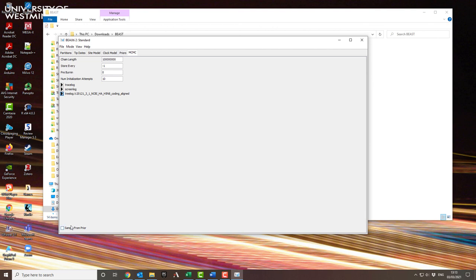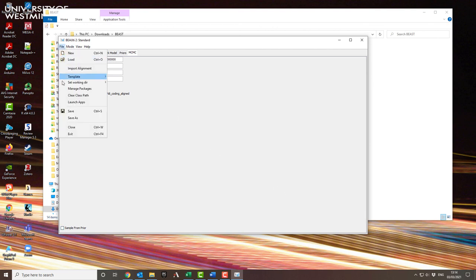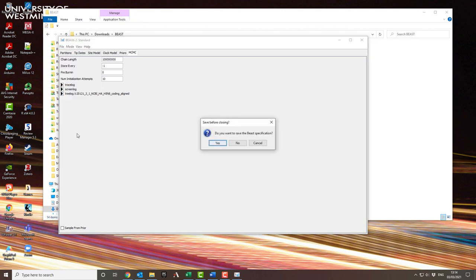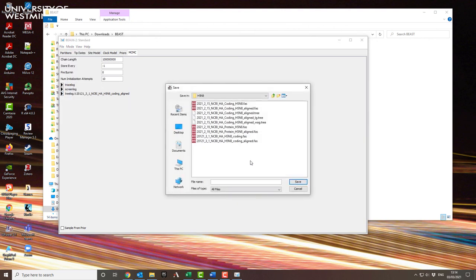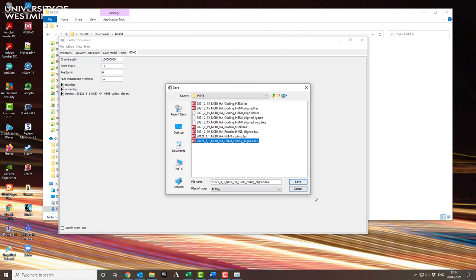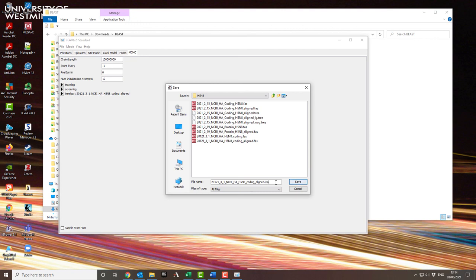And once you've done that, then you can actually leave the program. So if you click on exit, it'll ask do you want to save the specification, and yes, you do. Before you leave, pick the same file name as you used for the alignment, then just change the suffix from .fas to .xml. So the XML file is going to be the input file that will be read into BEAST.